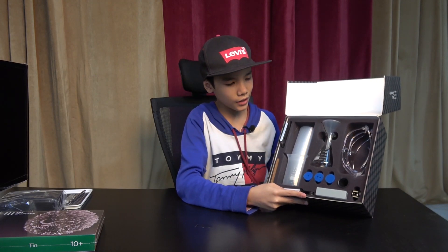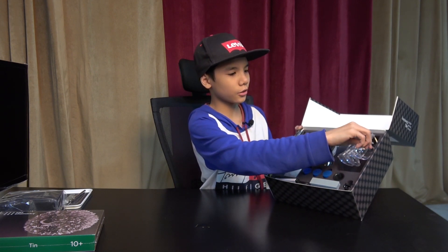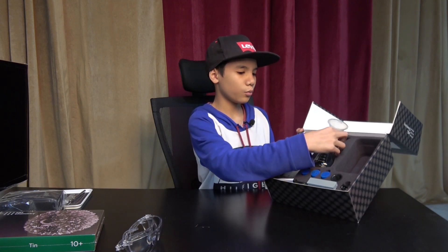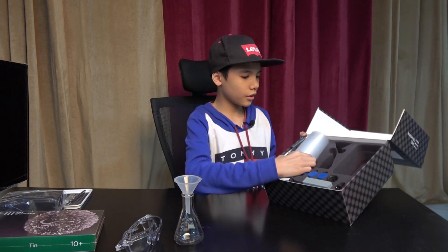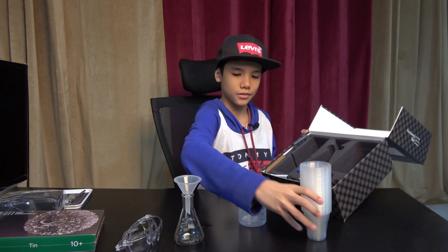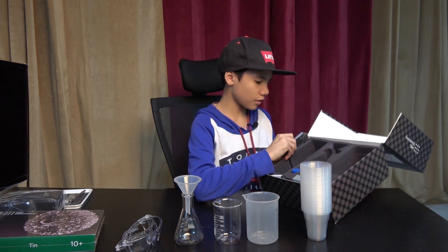Here are the contents of the starter kit. We have the safety glasses, the glass flask with the funnel, the 45 disposable plastic cups, the glass beaker, and the plastic beaker.